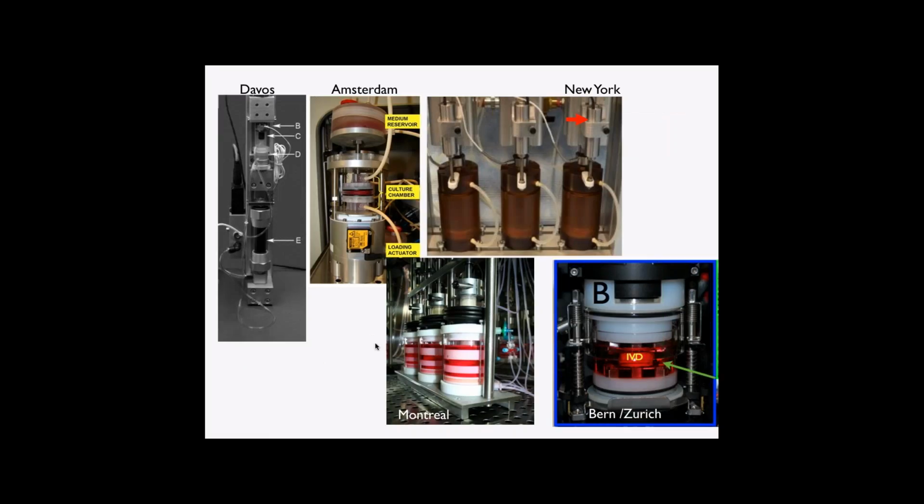This is an overview of these bioreactors. This is the design from Davos. This is a uniaxial compression. Most of them have a peristaltic pump and an actuator that is controlled. It's usually servo controlled with air pressure. So it's pulling, and so it's a fluidic muscle. That's the word I was looking for. Sorry. And then we have here this medial flow.